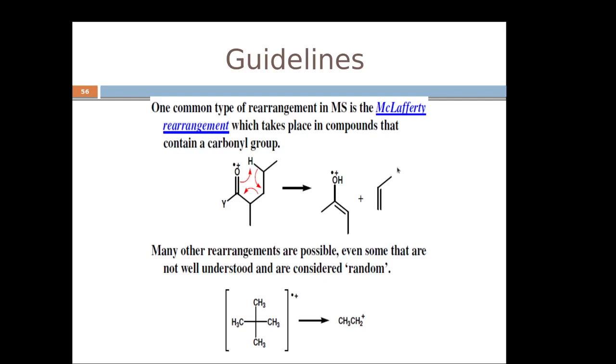And in addition to these very predictable rearrangement mechanisms, sometimes you could also see some very random, barely understood rearrangement mechanisms, which are often considered random rearrangements, such as the one shown below, right here.